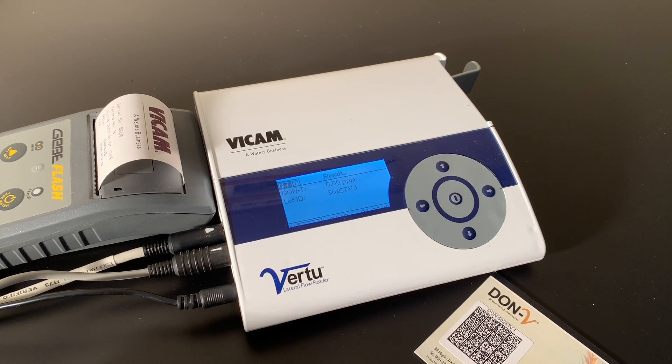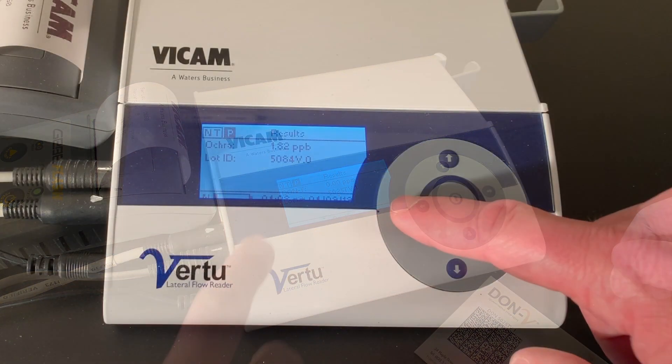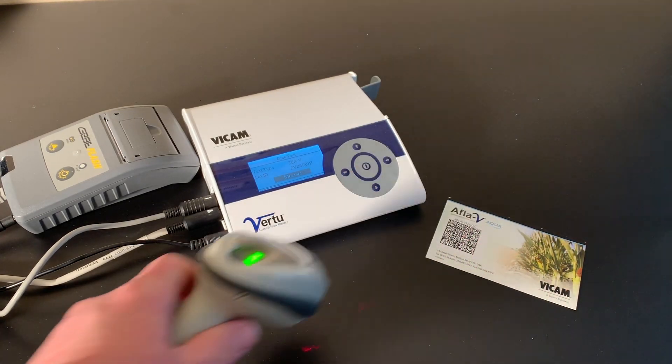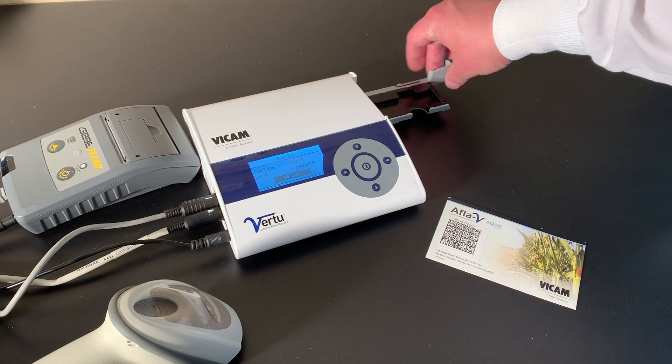Press the center button. The results are shown on the screen. Press the right arrow to move to P, then press the center button to print your results. Press the left arrow to move to NT for the next test and press the center button. Repeat until you've tested each strip.